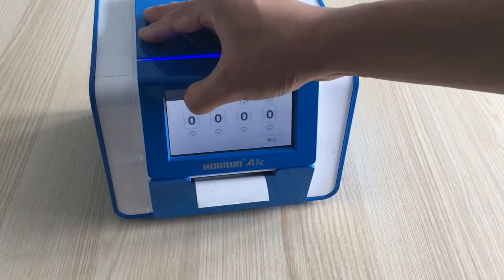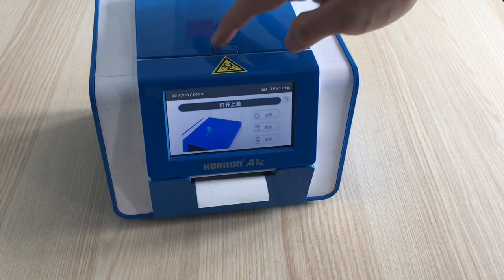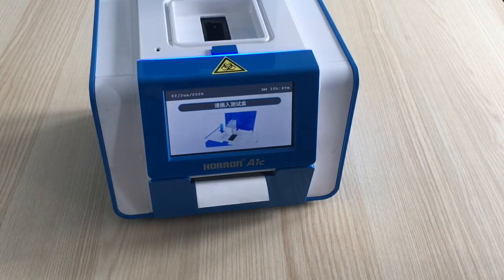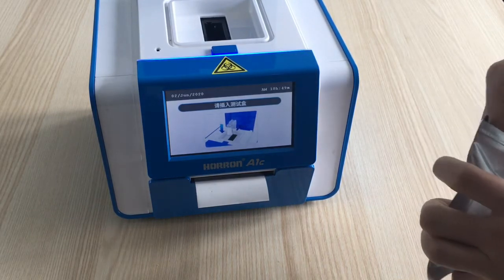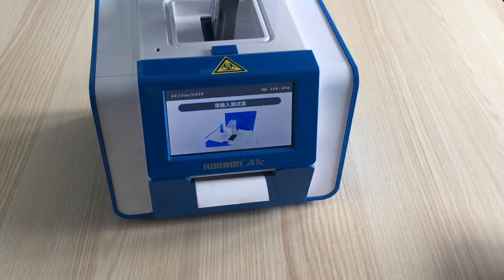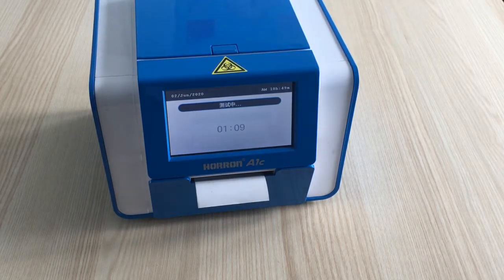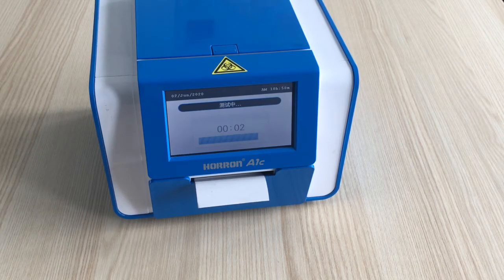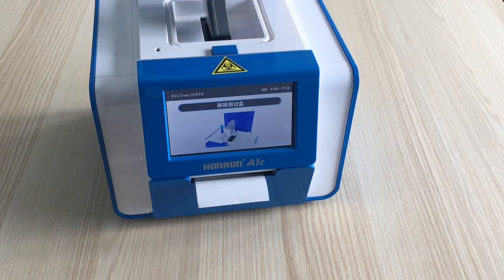Input the password for user: 1000. Open the box. Now we can test the correction box first. If it shows the test is a success, it means the machine is okay and ready to test the real sample.